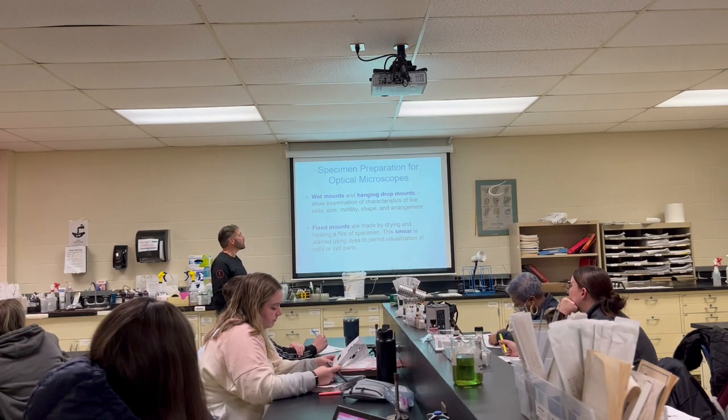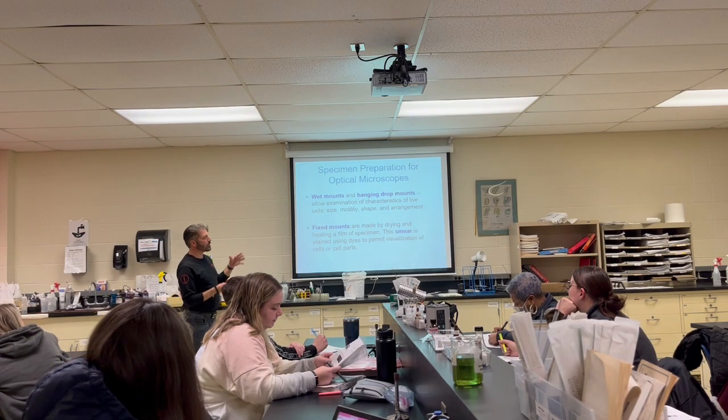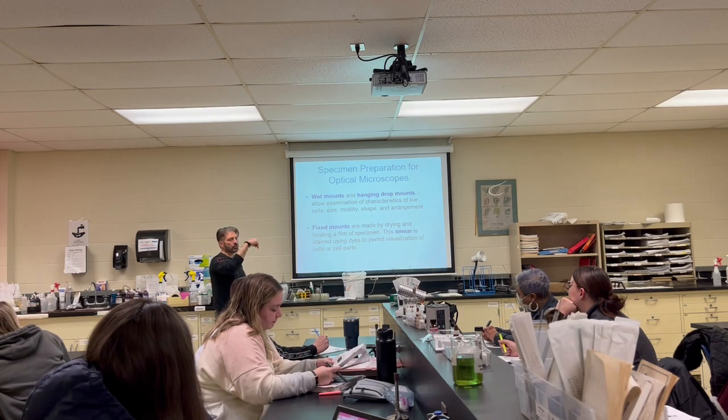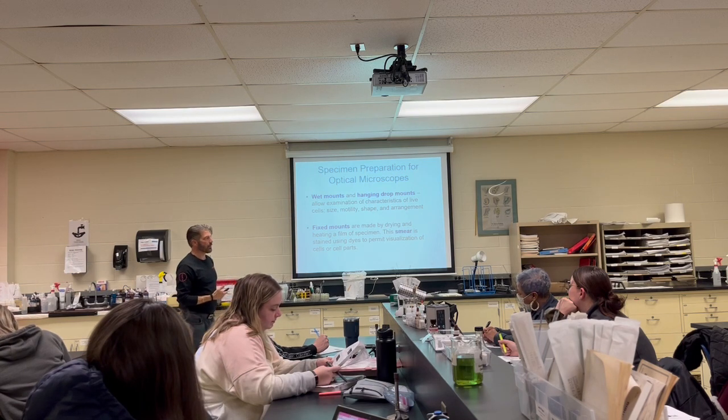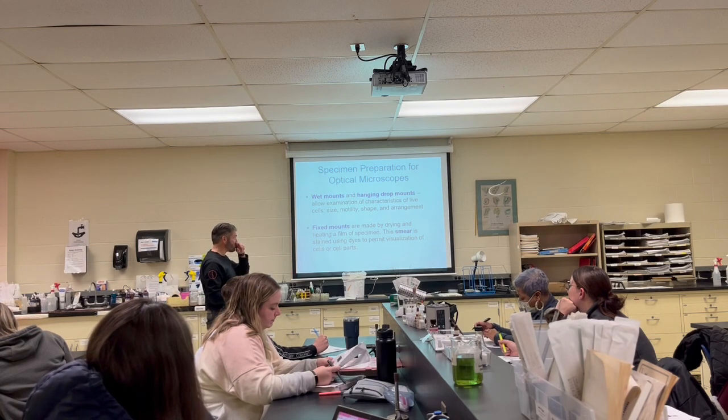Wet mounts and hanging drop mounts examine the characteristics of live cells. We put a drop of water in a well on a slide, turn it upside down, let it hang there, and you can look at it if you want to see something moving. Or bring in pond water or something from your aquarium. We can definitely do that if you want.